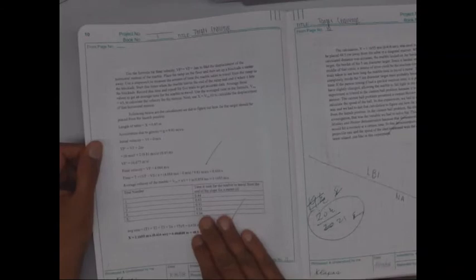You see all these numbers, they must also be properly numbered. Sometimes there are printed tables which you can attach, and she has actually signed it as we have seen before.